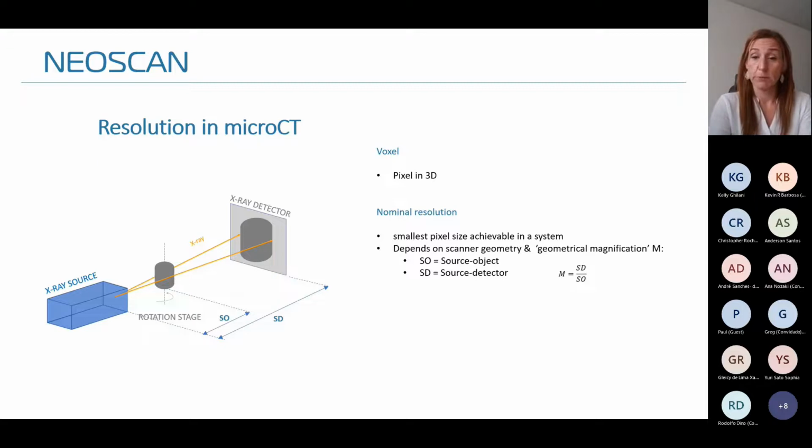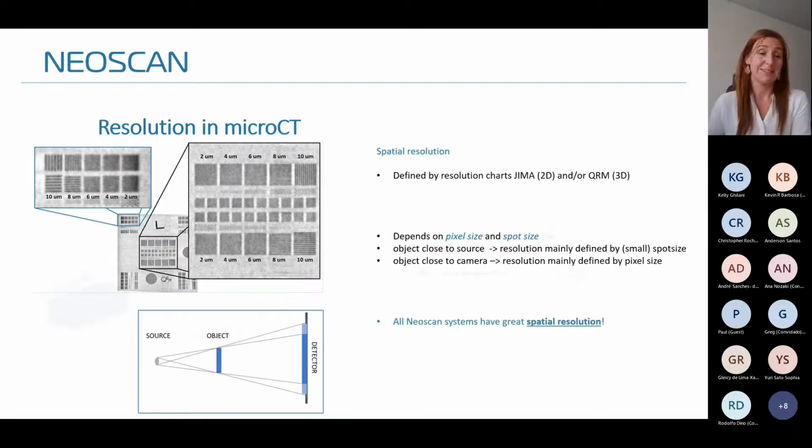There's other things involved in resolution of a MicroCT. Remember, the question you're trying to answer is, what can I see in my sample? And for that, one needs to look at the spatial resolution of a scanner.